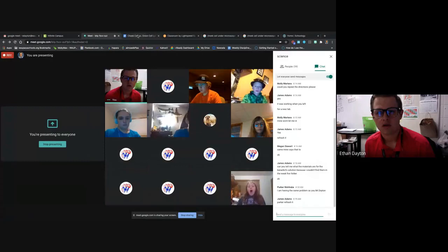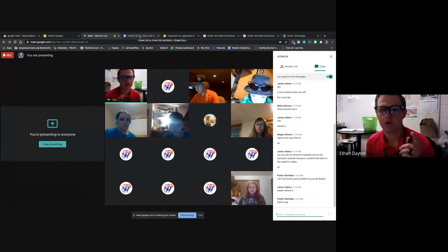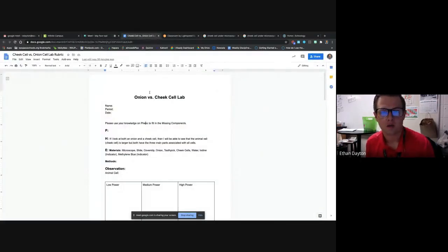Now, you're probably thinking, well, how am I going to come up with that? Well, let's take a look at the hypothesis that was already given for us. Mr. Mallon and I already came up with a hypothesis for you. You didn't get a choice in this case. Sorry. Okay, so for our hypothesis, I'm going to read that to you.